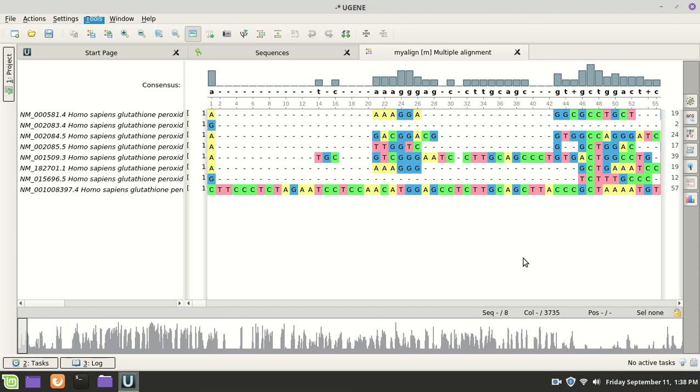There are people who just publish things with an alignment thinking, oh, well, these things are accurate, right? Oh no, these things are very, very inaccurate without you doing a lot of work beforehand to get these to align. So use smaller sequences after you've looked at them and compared them with dot plot, and I will probably go through and do that with you, maybe on this one, and that should help you out in figuring out how to actually use these.